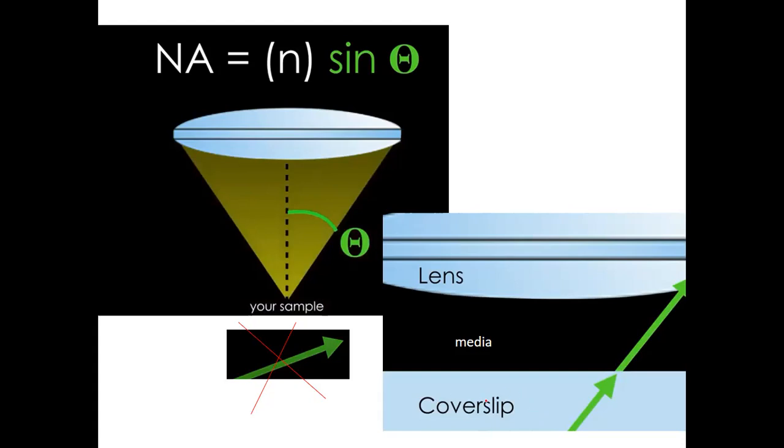You have placed the cover slip. And how are you visualizing your specimen? I'm visualizing through my objective lens. And between this lens and cover slip is what? There is a space or there is a vacuum, which I mentioned as a media.